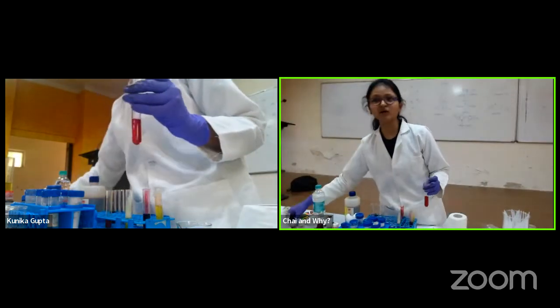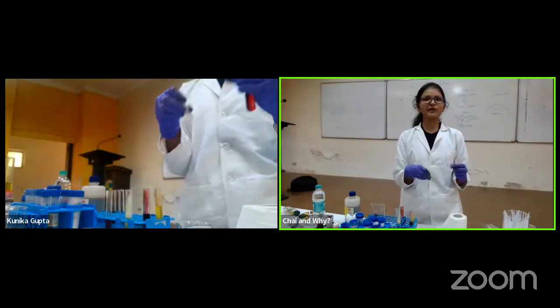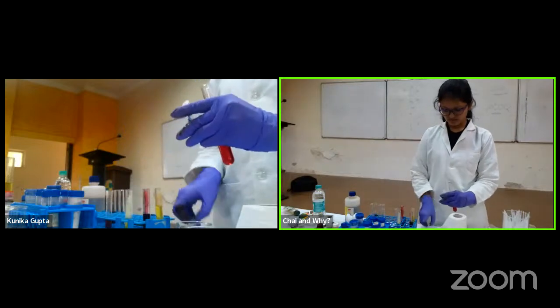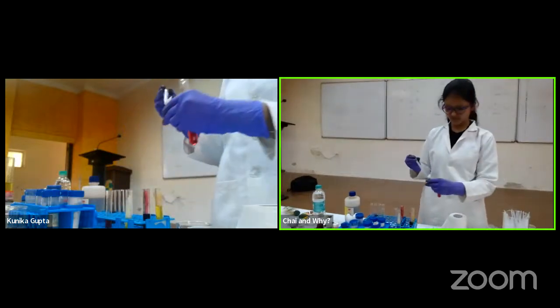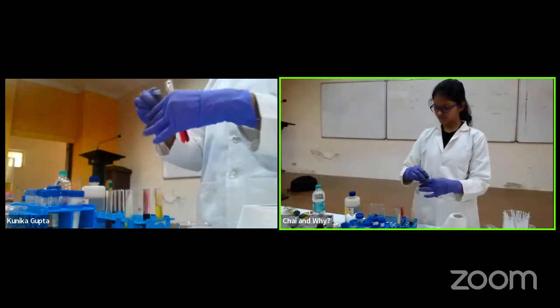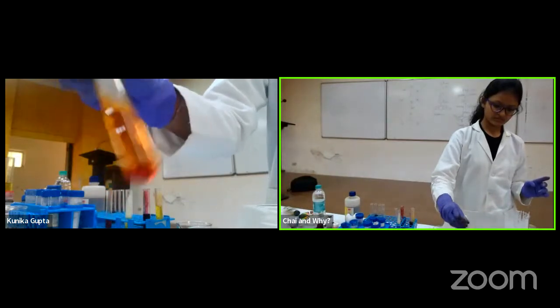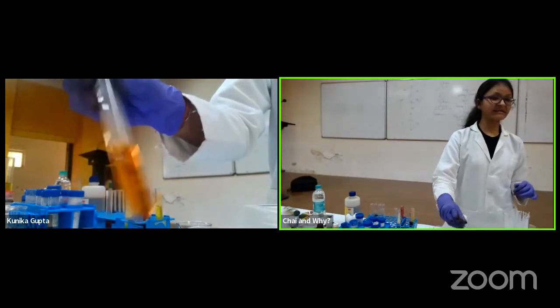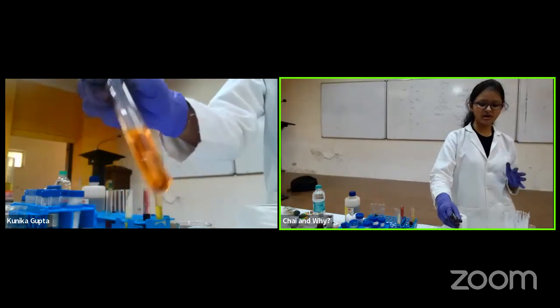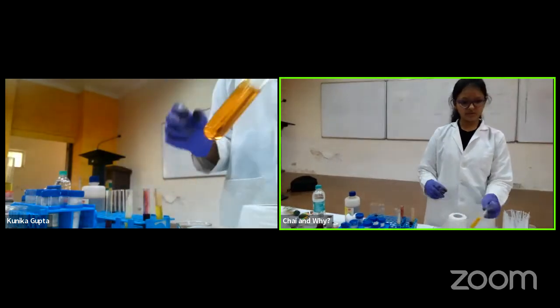At this time I cannot add sodium hydroxide because it was dissolved in water. It won't dissolve in this at all. So there's no point of doing that. So I have to add a base that has to be quick enough. Because I am adding random stuff without measuring or anything, let's see if this works out. Otherwise, I'll have to do it again. Okay. Pink became light orange now.